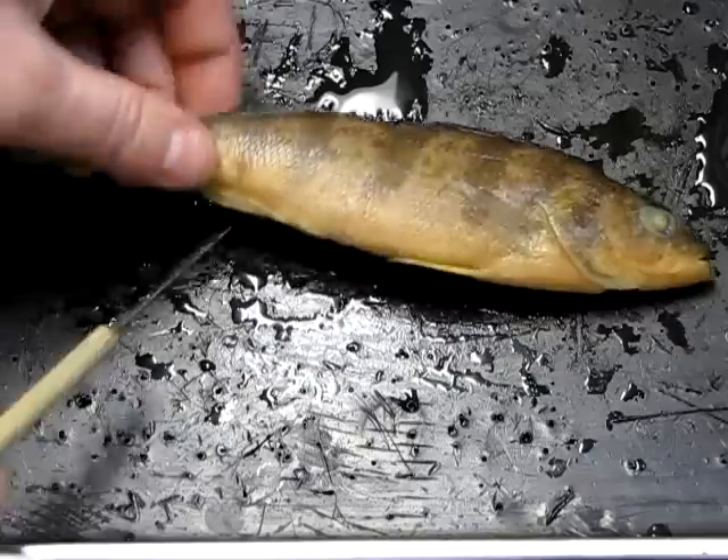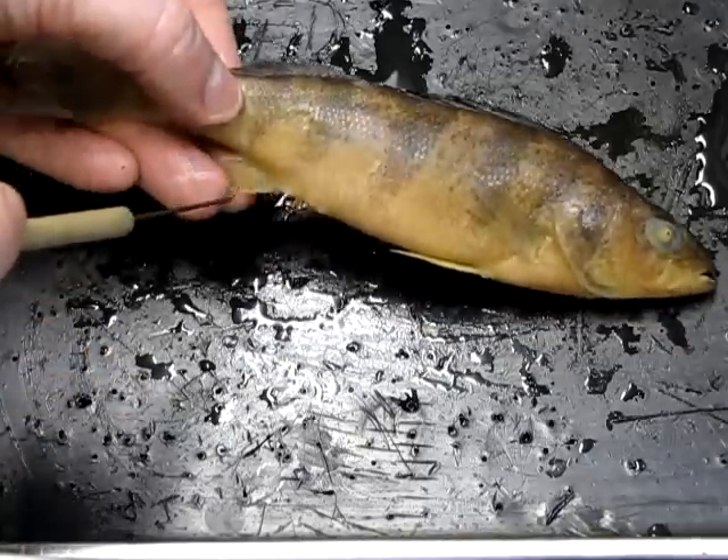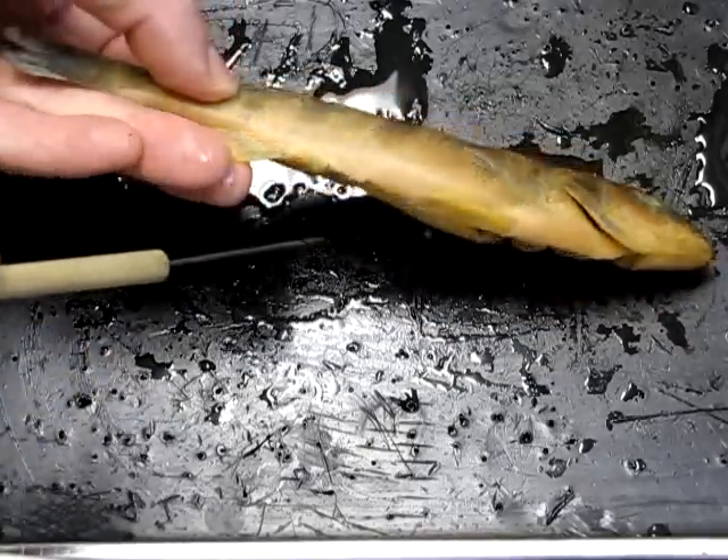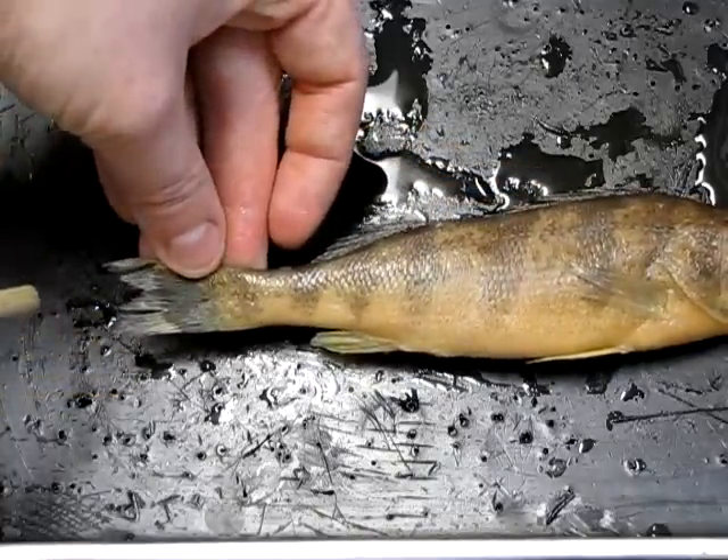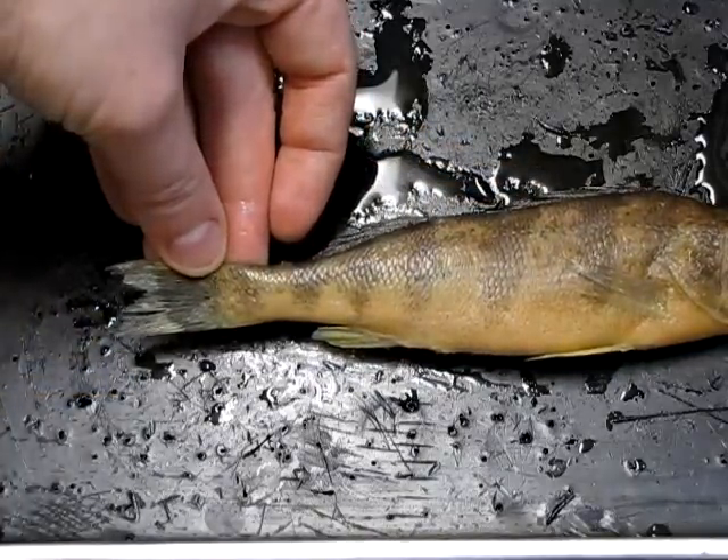Down here we have the anal fin, so called because it is close to the anus, which is right here. At the tail we have the caudal fin.